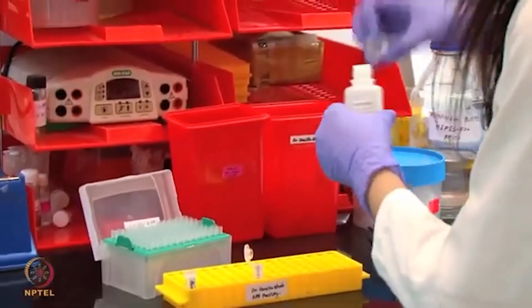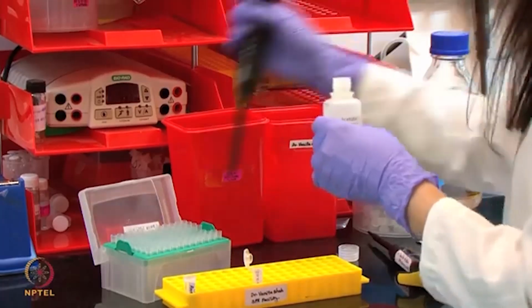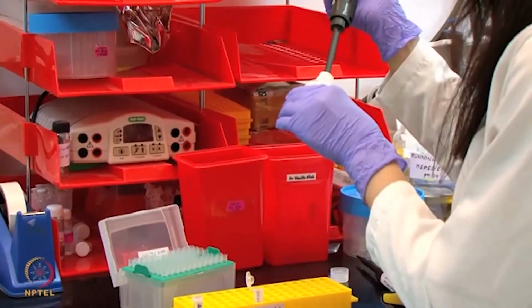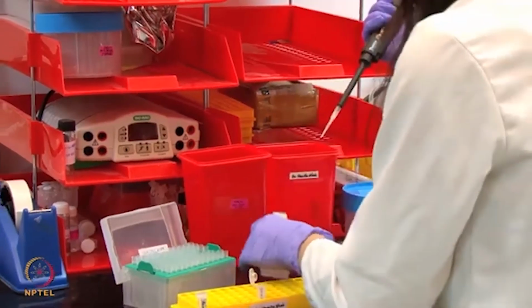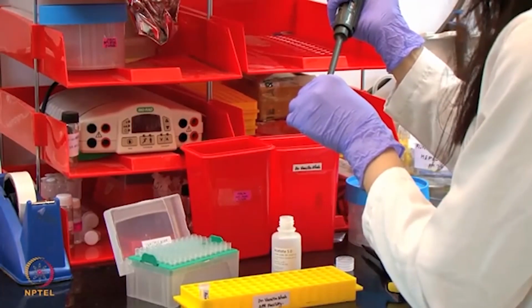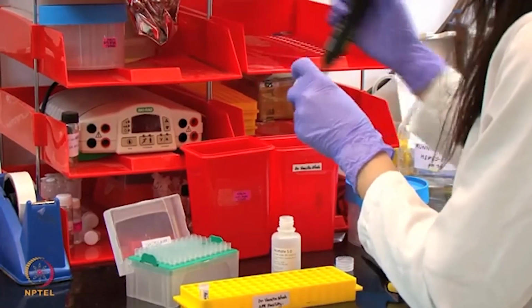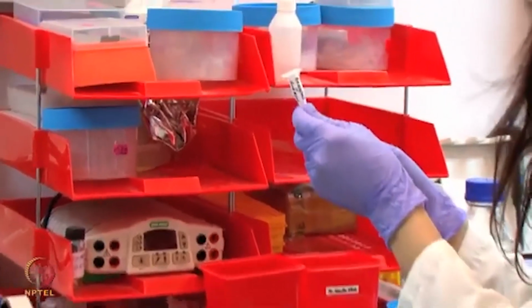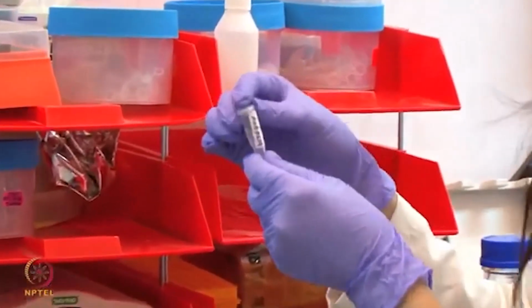The choice of the correct immobilization buffer is an important parameter to consider, and the pH scouting feature of the system can help in choosing the correct pH of the immobilization buffer. This is our 30 microgram per ml ligand solution.